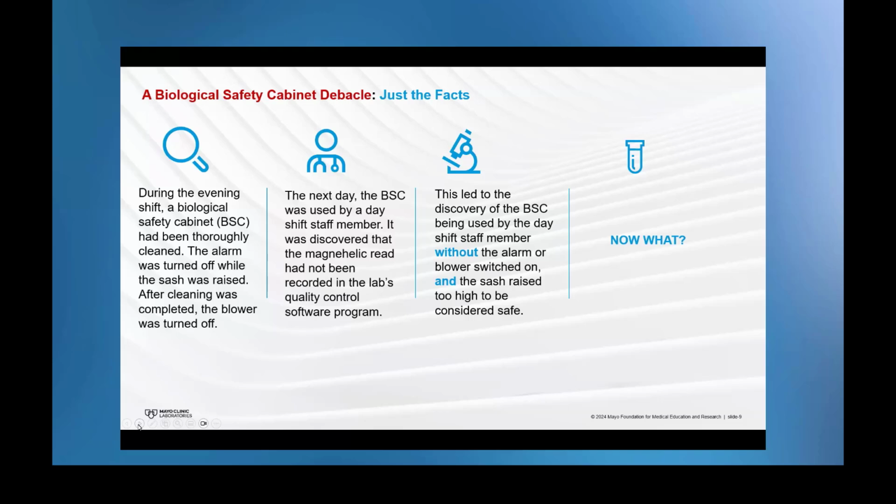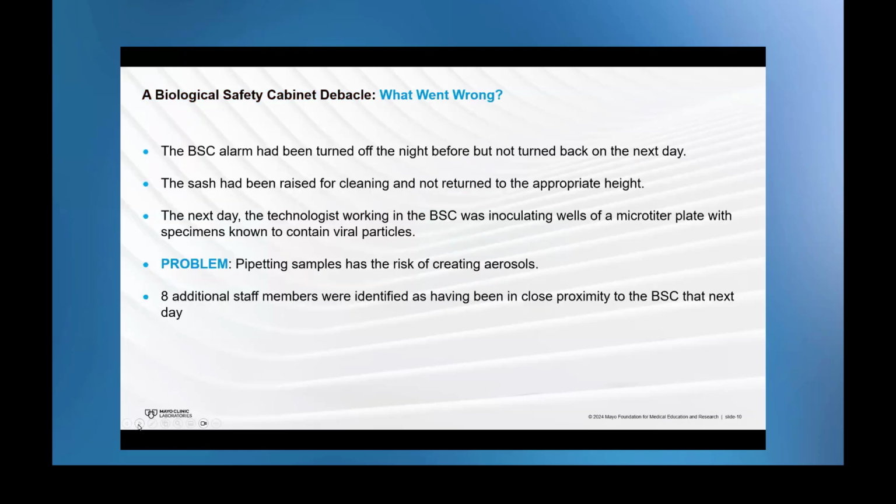Then they discovered the BSC had been used at that time without the alarm or the blower switched on, and the sash was raised too high to be considered safe. Now what do we do? So let's talk about what went wrong here.